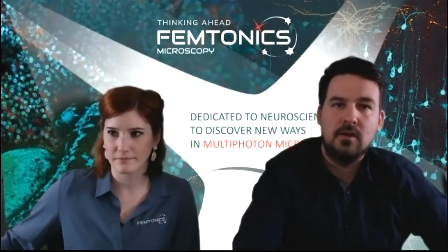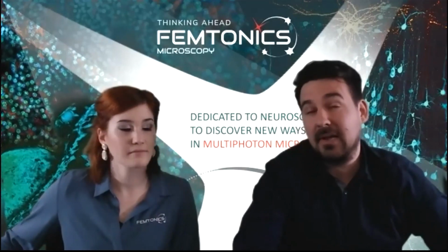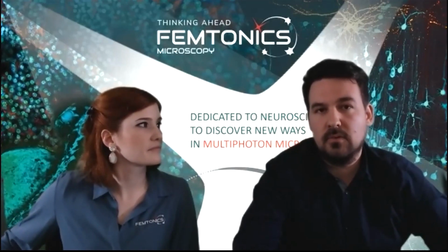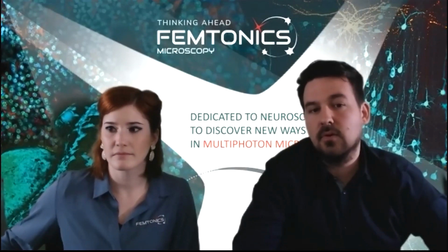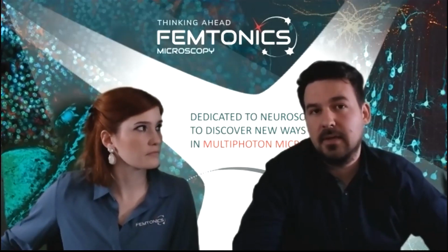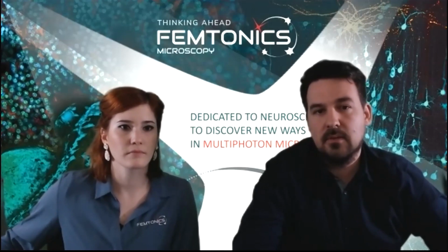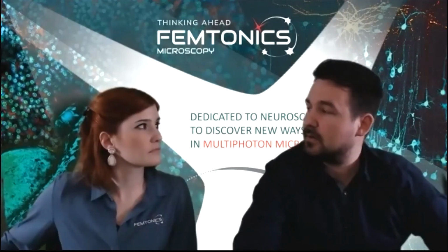You can order CW lasers as well for the microscope, for the rig. So if you prefer one-photon excitation for uncaging, then it's possible. I do recommend two-photon uncaging for several reasons, but of course, in special cases, the one-photon is also quite useful.